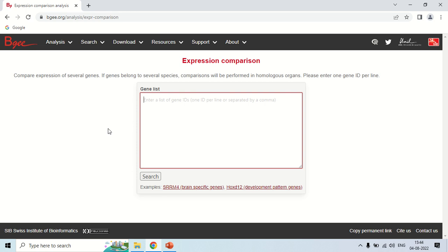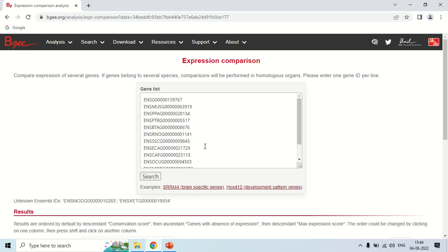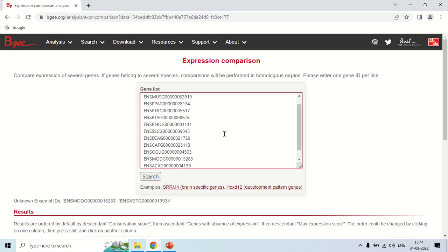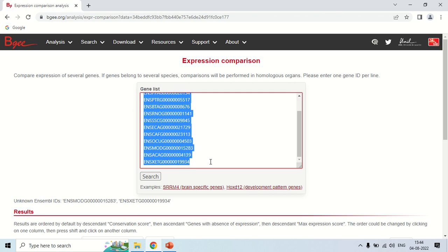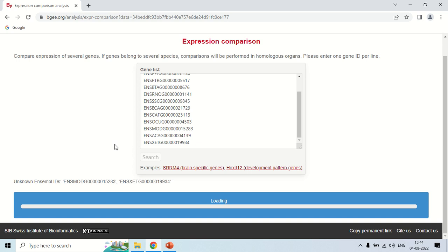There are certain examples provided, so just for demo purposes I am clicking on one of these examples. As I click here, it automatically takes the genes included in this example — it may take a few seconds depending on the number of genes. Now it has taken the genes involved in this example and will show the comparison of expression levels of these genes. Just click the search button, and it will take some time as it is now making the comparison of all these genes.